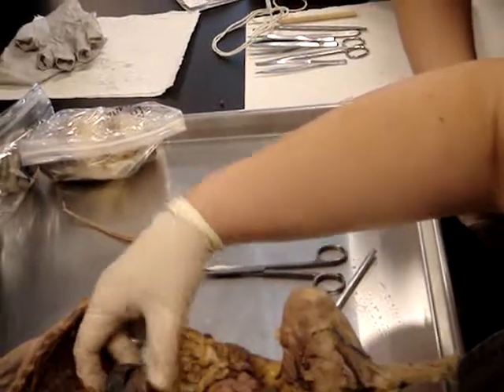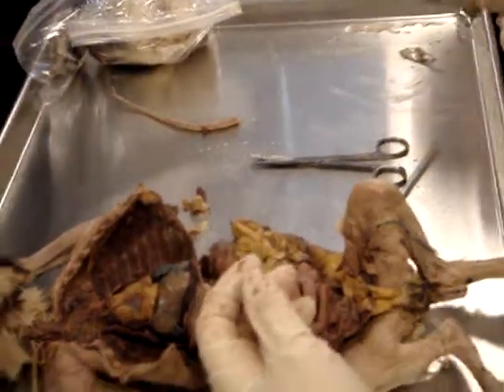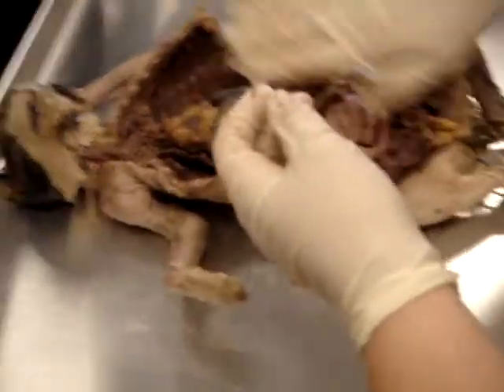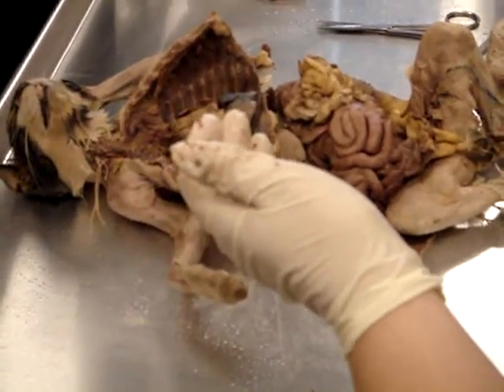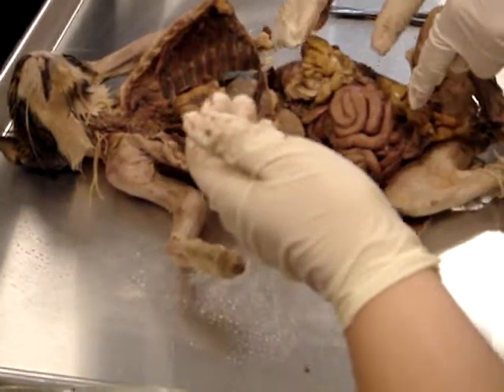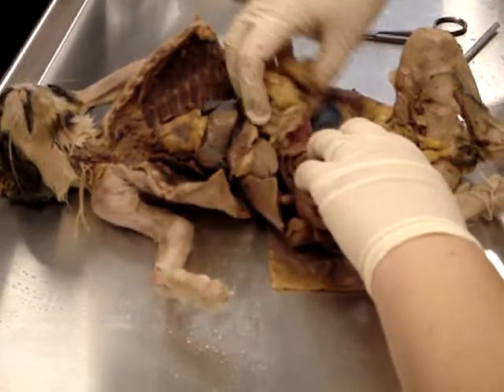He's totally screwed up. Did he fall or something? No, I think it was just a birth defect. I think he just had a really big hole in his diaphragm, and so as his organs developed, they kind of moved up. That was probably really painful. This poor thing. But why is his stomach fat? Because it was fat down here. I don't know. I can't figure that out. He was constipated. We'll work our way down.